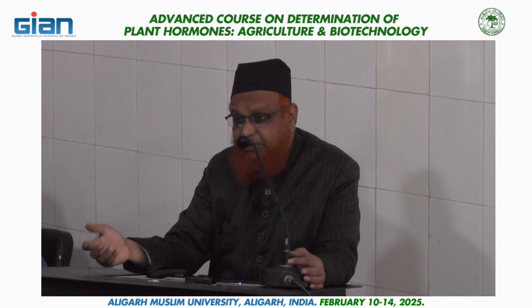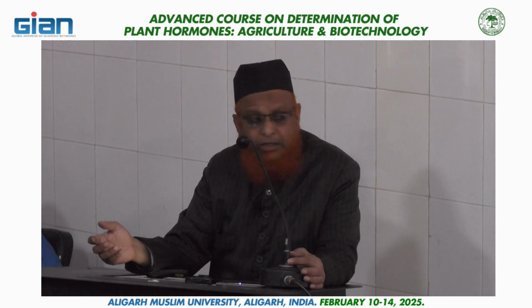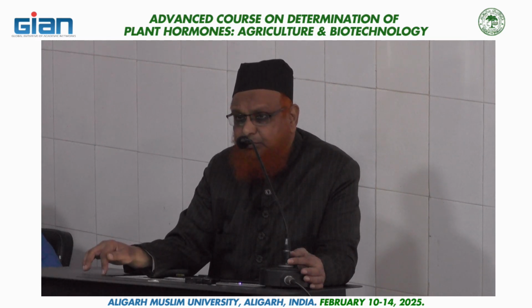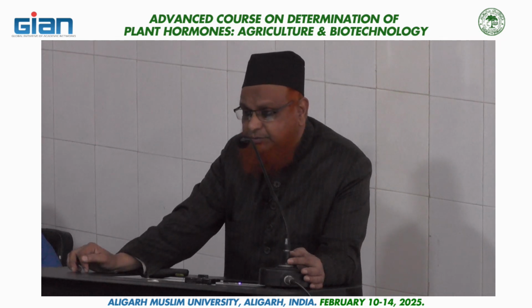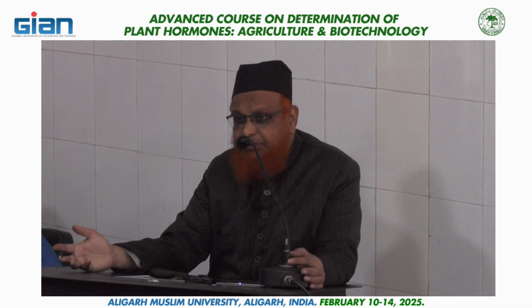Obviously, you have to dilute it because it is highly concentrated, and karrikins are required in very minute quantity, 10 power minus 8, minus 9 molar concentration. Very minute concentration is effective in inducing seed germination and plant growth. So you have to dilute it. In our experiment, we diluted it 1 to 1000 dilution, 1 to 500 dilution, 1 to 250 dilution, and 1 to 100 dilution. Okay. So obviously 1 to 1000 dilution was the most dilute, and 1 to 100 dilution was the most strong, or the most concentrated, you can say, right?